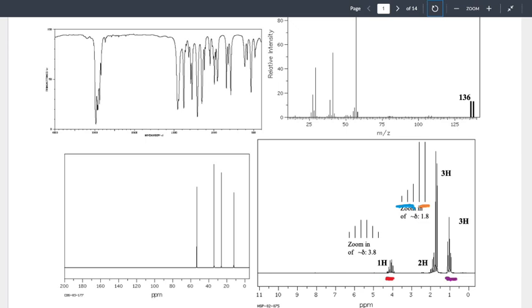What does it mean for the integration? Okay? The integration is effectively the count. So when I go through, because now we're looking at HNMR, HNMR counts every single hydrogen. One of the benefits of HNMR is the hydrogen nucleus, protium, is nuclear or magnetically active.